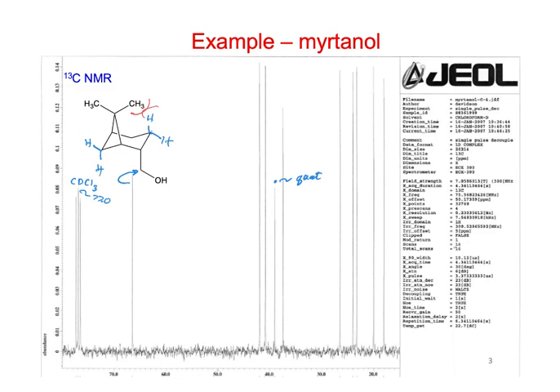Looking back at the proton NMR, the other thing we might be able to say is that if that one's the quaternary, these three might be the CHs, because we have this one and this one, all are CHs. So there's three, and those would match. What about the CH3s?